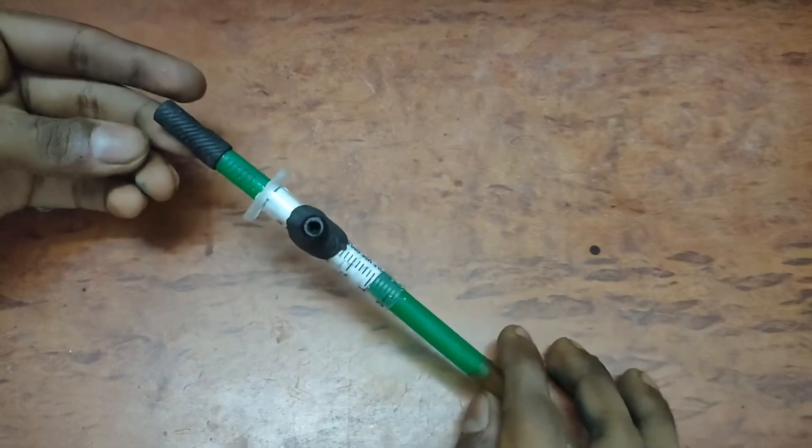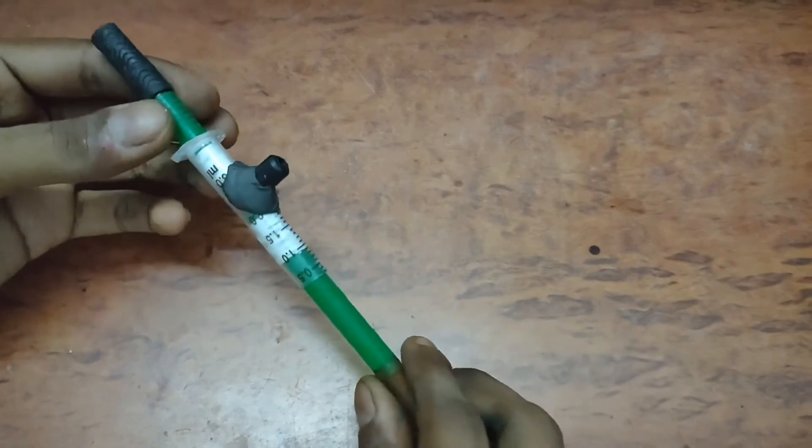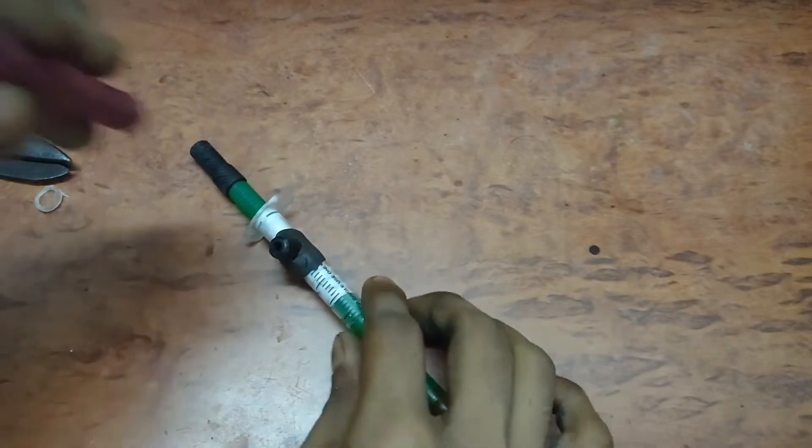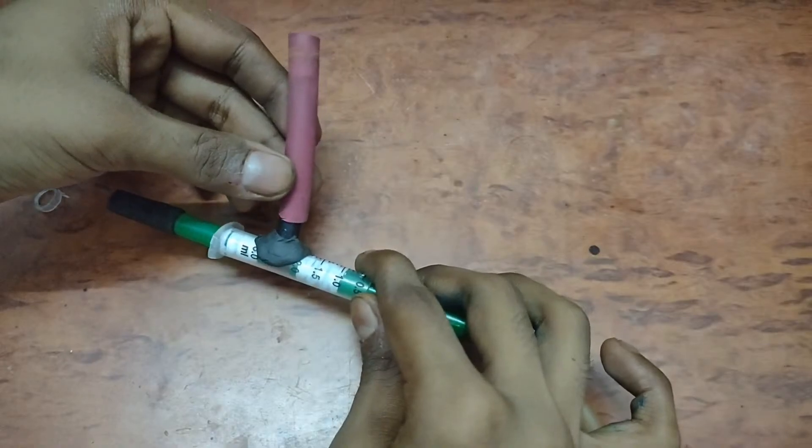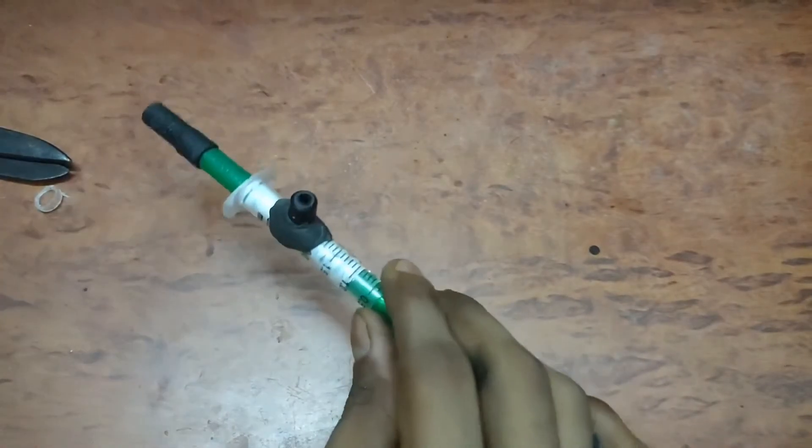The black nozzle which we have secured is our vacuum hose, and you can see that the rubber tube can be attached very nicely in this.